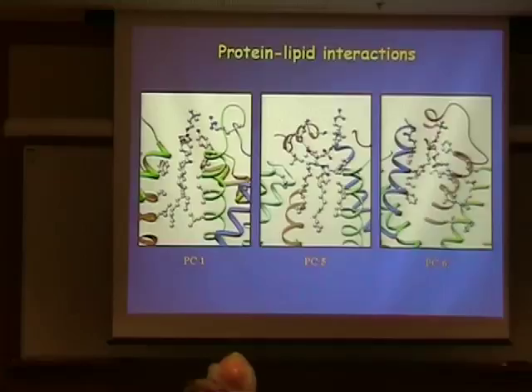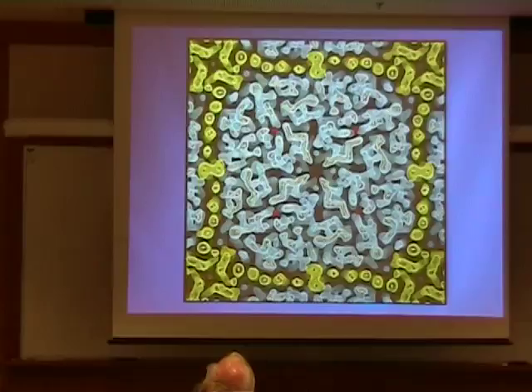And so I want to summarize my talk. You have probably seen this, you're sick of it by now. This is a slab through the density map. In blue is aquaporin zero. In red, in the middle, is the water molecule in the center of the membrane. And the whole thing is surrounded by the lipid molecules, which form the seal around the proteins.